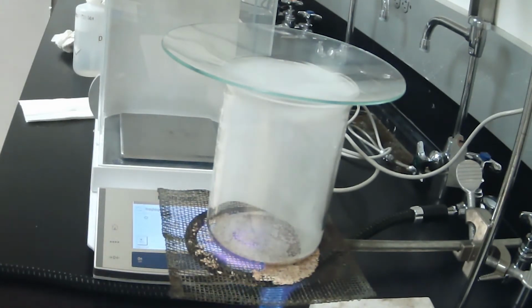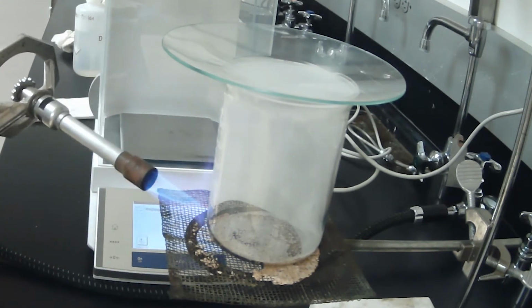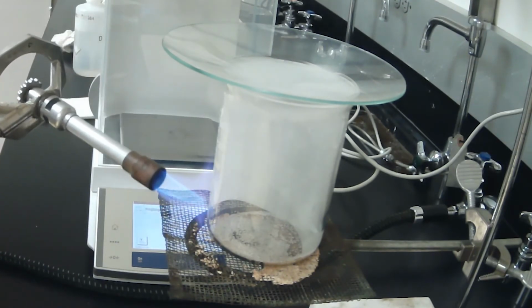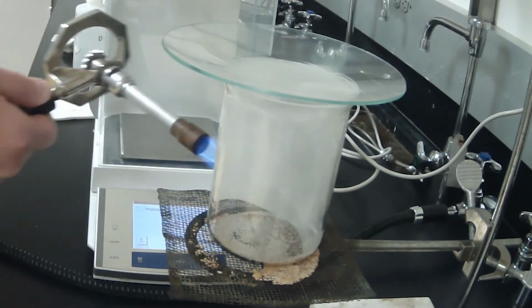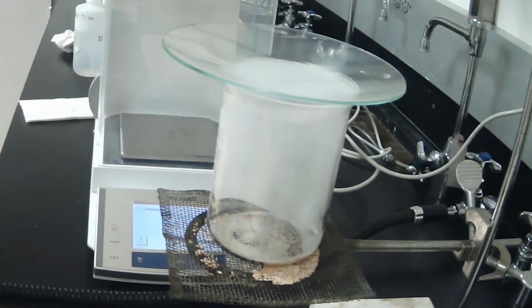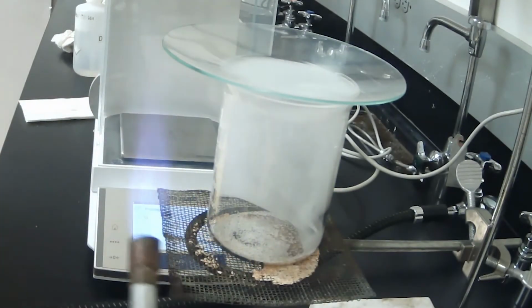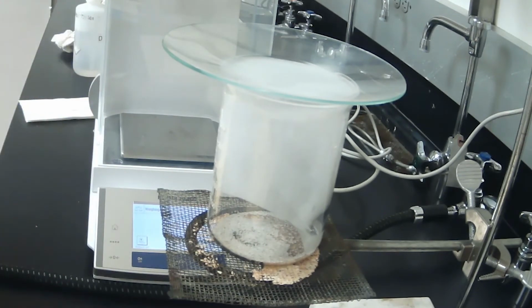Okay, it appears that most of the bottom is no longer smoking. Now, we're going to do this twice, so I'm now ready to start making my 1-inch gap all the way around. I'm just heating the bottom corners of the beaker. And we will look around to the backside, make sure there's a gap there. And one of the nice things about these particular Bunsen burners, as long as you don't touch above here, it stays relatively cool.